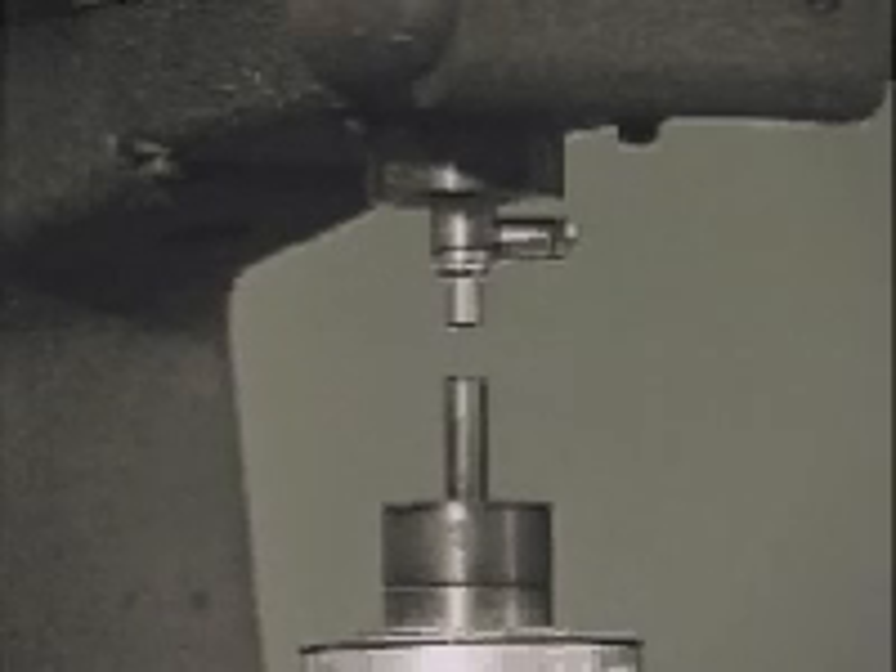The anvil on which the test specimen rests must be clean and smooth. The smallest diameter anvil, which is still large enough to prevent rocking, shall be used.